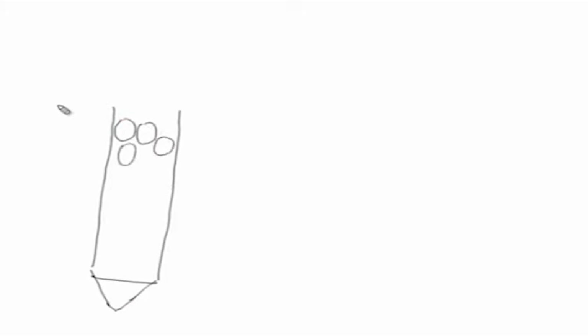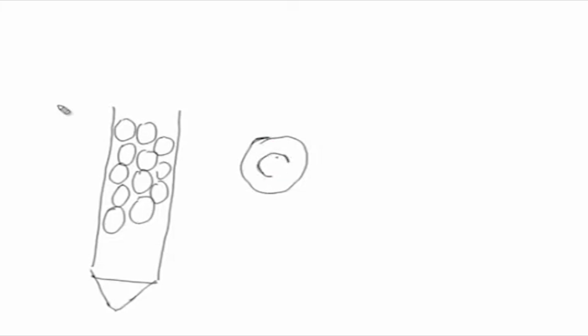Now, what is the property of the bead, what is the basis of separation here? These beads are porous beads, actually hollow beads. If I draw a single bead here, it is totally hollow inside and has a particular pore. This is just a schematic: these are cross linked polymers and they present a gel like structure, and they have a particular porosity because of this cross linking.